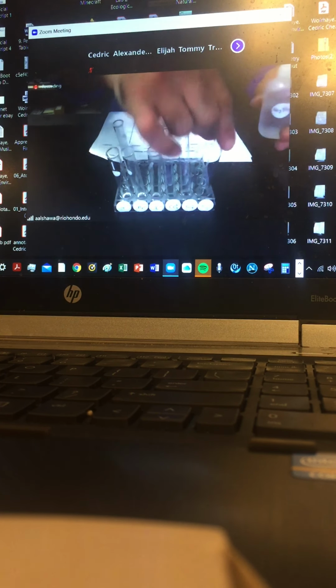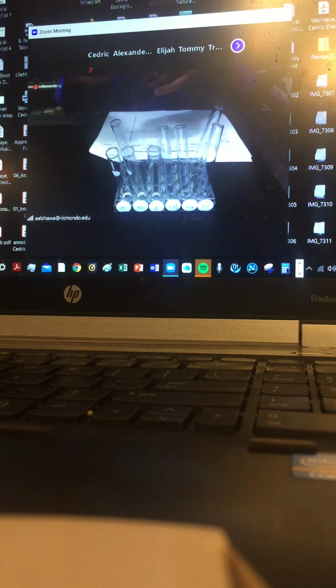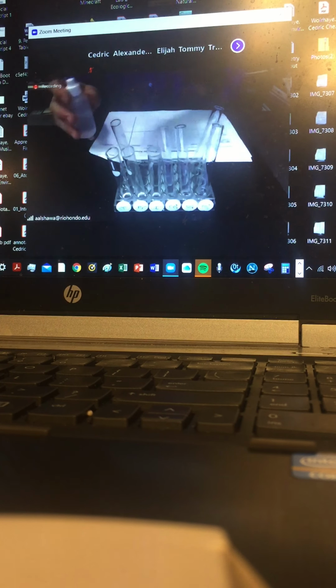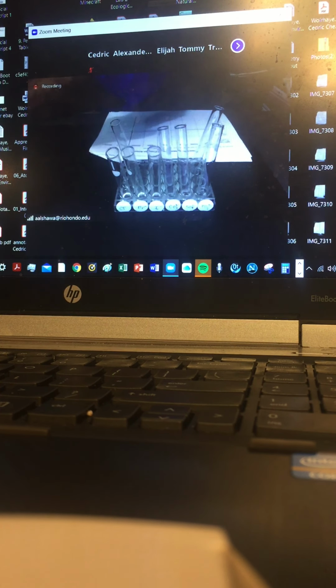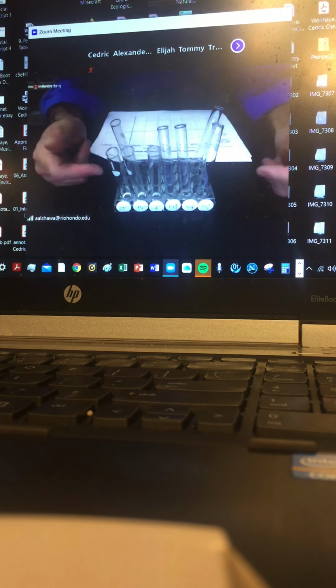So what does not work is sometimes much better than what works. So what does not work for this experiment, what goes up against the result, is contamination. So any contamination going on with those, that's the reason why they have to be clean and very clean in between all these tests. And the test for tonight will basically be a replica of three times. So if I'm using 8, 3 times 8, 24.